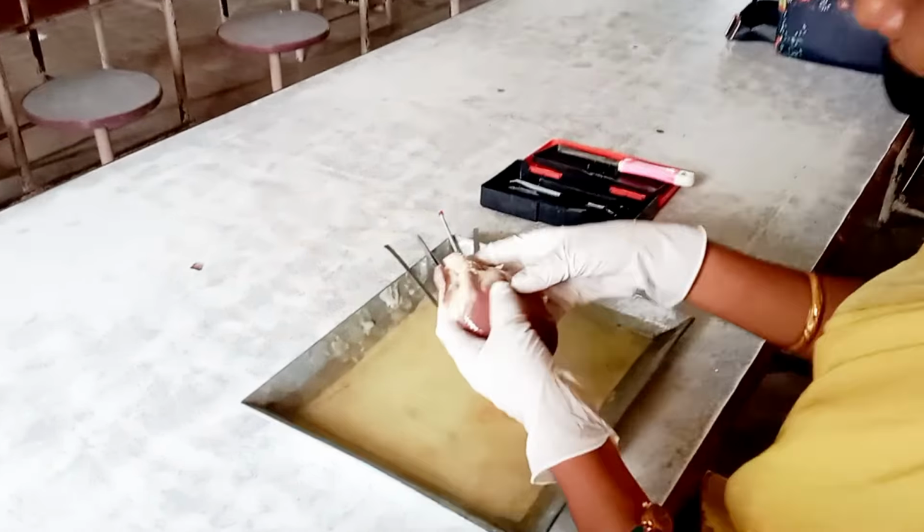Generally, heart is not present at the left side of the chest cavity. For example, if you imagine that this tray is your body cavity, your heart is not completely on the left side actually. It is at the center of the chest cavity like this, but its apex end settles in the left side of the chest cavity. That's why usually heart is said to be in the left side of the chest cavity.